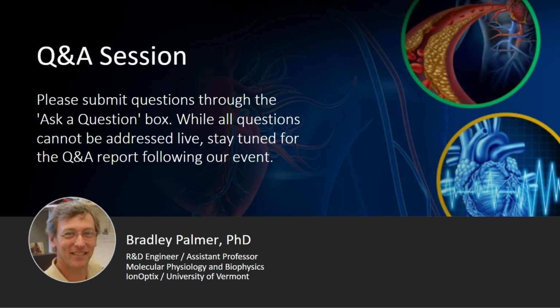Okay, can you use flash frozen heart to section and analyze, or does the tissue have to be fresh? I think it's related to a previous question asking about the viability of the slices. I don't think you can expect to see force generation after it's been frozen. You might be able to get very good images from that, so imaging is certainly possible.